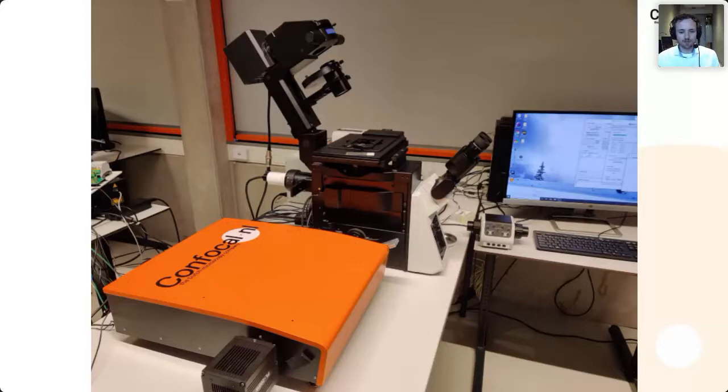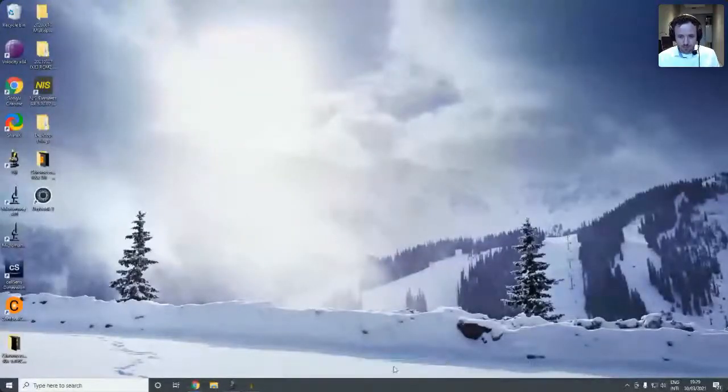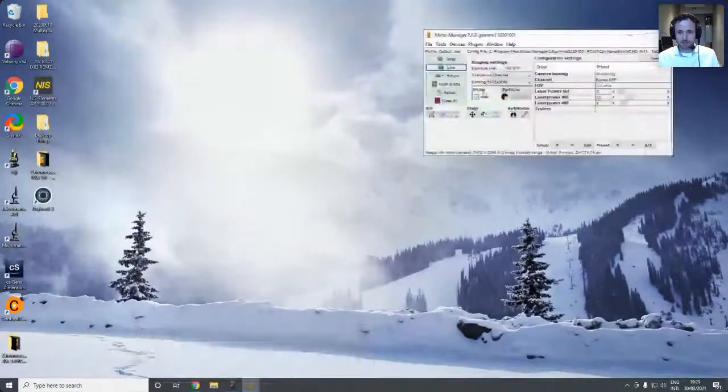What I wanted to demonstrate during this demonstration is the resolution throughout the field of view that Peter also showed in his presentation. So you're going to witness that live. I will start sharing my screen here. You should be able to see my desktop.